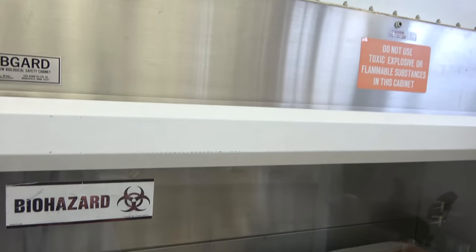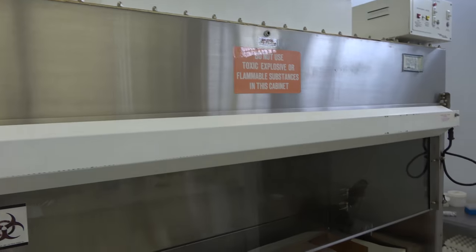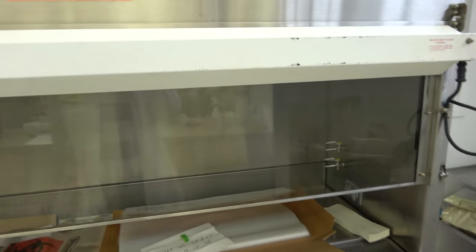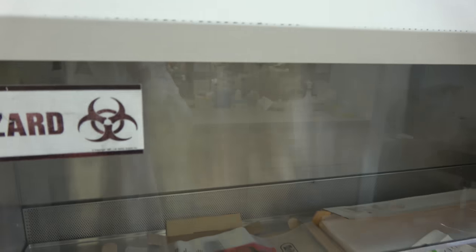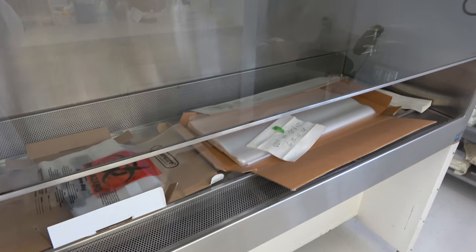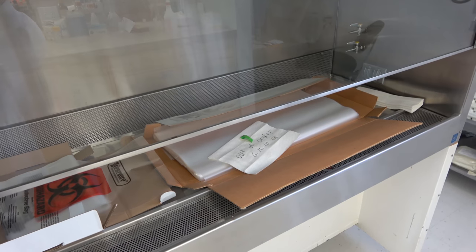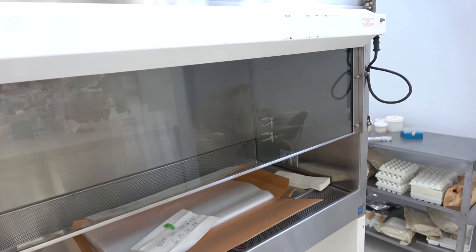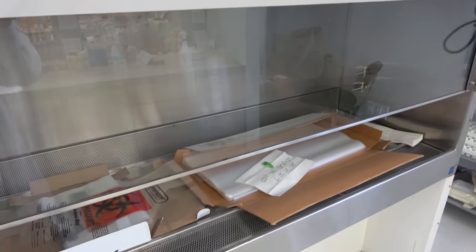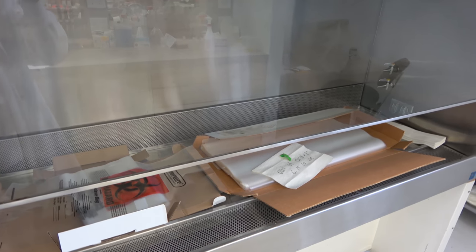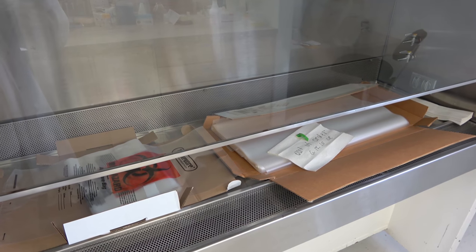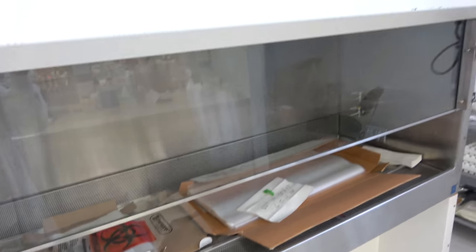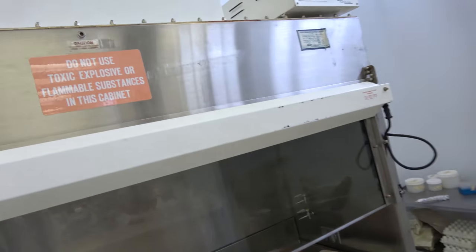Now this hood is much different. It's not a fume hood. You've definitely seen it already behind me. This is more of a biological hood. This is where you would work with biological materials like petri dishes and stuff like that. You don't always have to work with them here but if you're working with something really really sensitive like let's say you're working with brain cells and petri dishes or something like that you know you want to work with that in here. This is not in commission anymore so I don't need to worry about it nor do I ever use it.